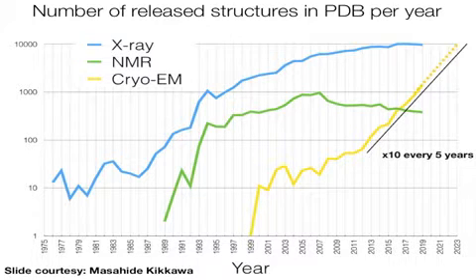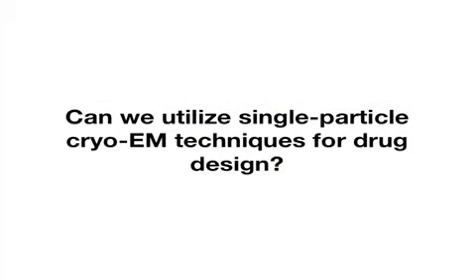So after that brief introduction, I'm going to get into the meat of my talk. Building on these developments that I've just introduced in cryo-EM, what we really wanted to do is to ask whether we can now utilize these increasingly powerful techniques for the purposes of drug design targeting HIV integration.